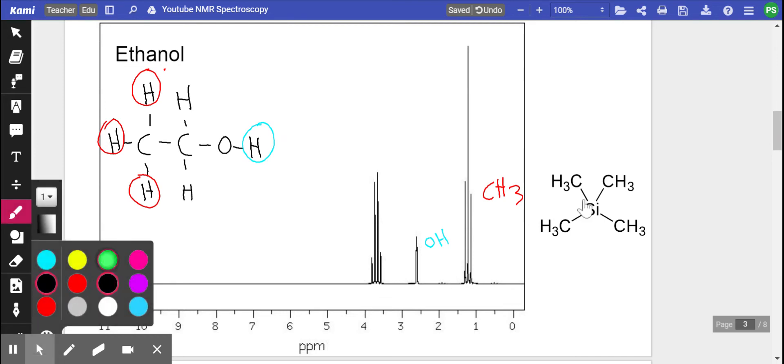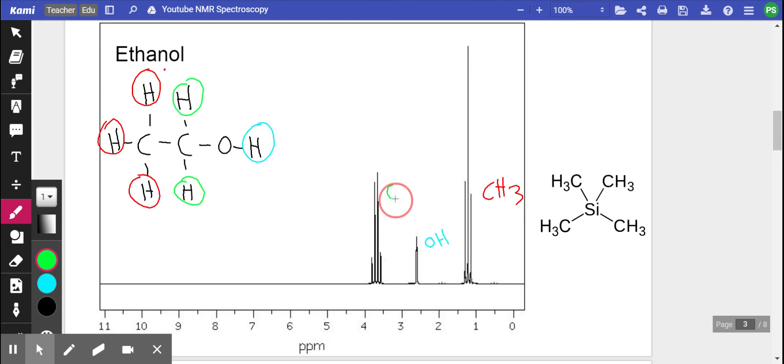And finally we have the third hydrogen environment which is here, the CH2 group. It needs an even weaker magnetic field because it is also close to the oxygen over here.